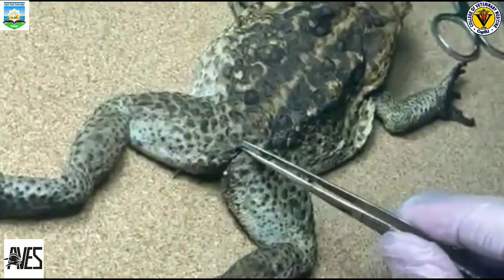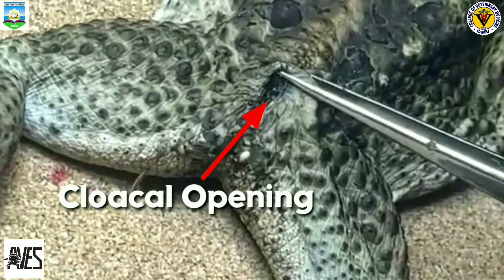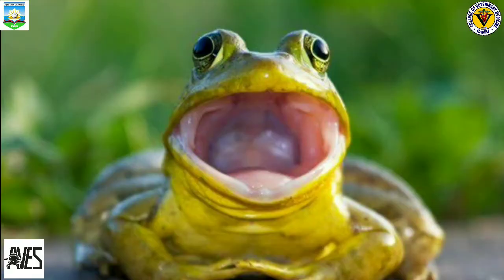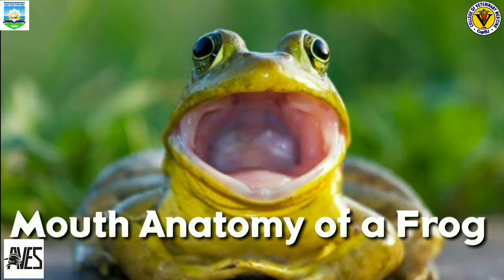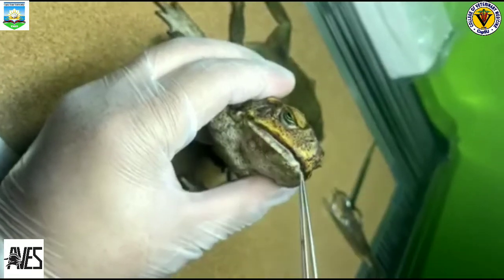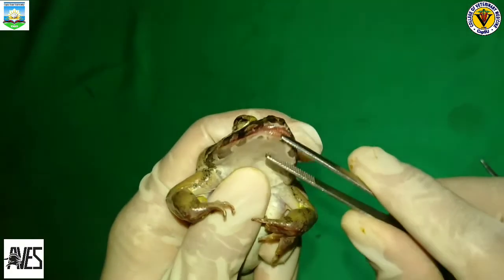This is the cloacal opening of a frog. The opening of the cloaca through which undigested food, urine, eggs, and sperm are passed. Let us explore and describe the mouth anatomy of a frog. This is the mouth of the frog. We need to use forceps to help us open the mouth of the frog.